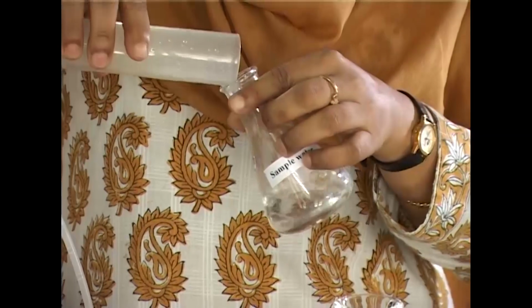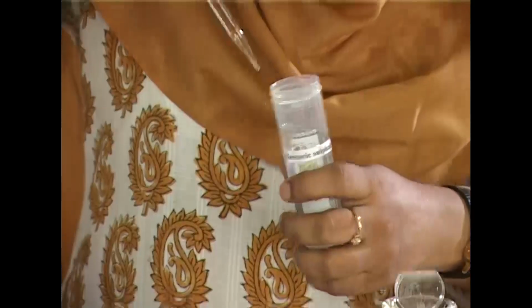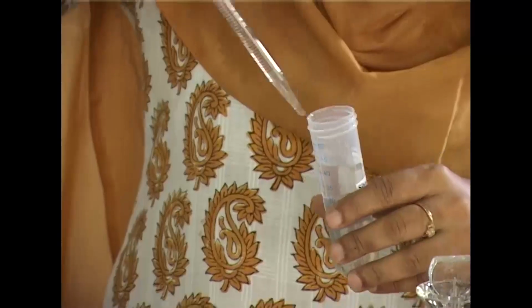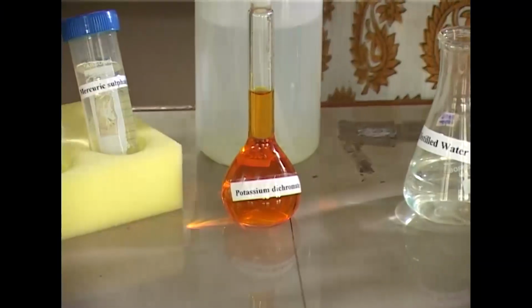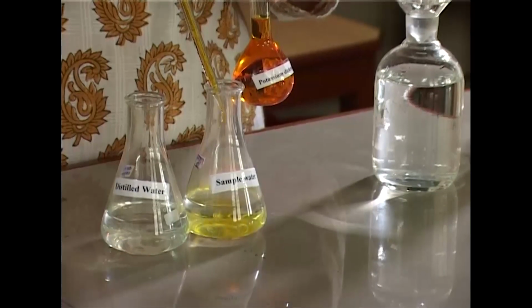In the first step, we take 50 ml of the water sample and we add about 1 ml of mercuric sulfate and 1 ml of silver sulfate and about 5 ml of potassium dichromate, which is used as an oxidizing agent. Ma'am, what is the significance of using mercuric sulfate and silver sulfate during determination of COD?